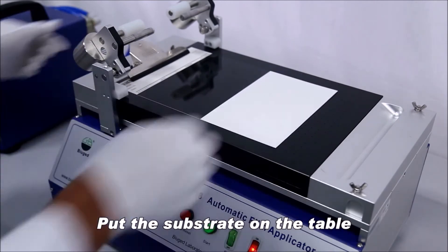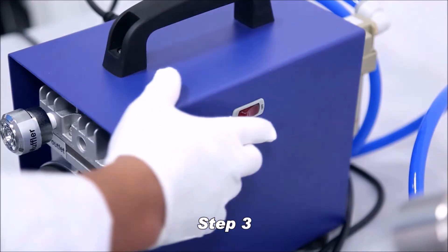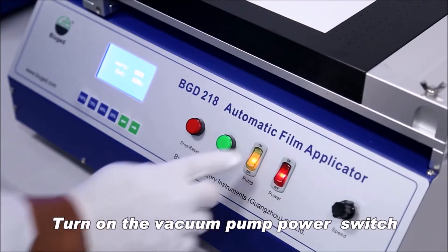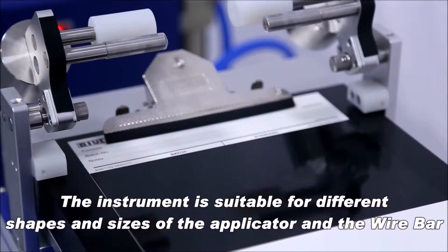Step 2: Put the substrate on the table. Turn on the vacuum pump power switch. The substrate would be absorbed on the platform.